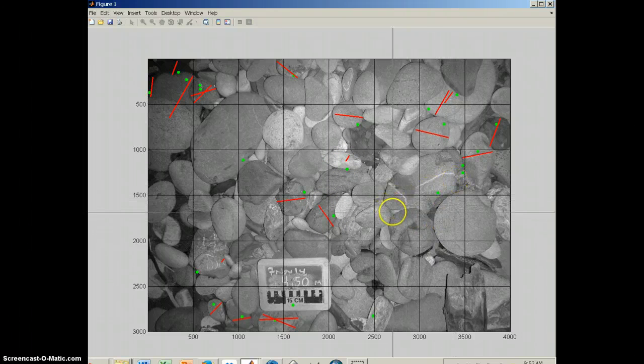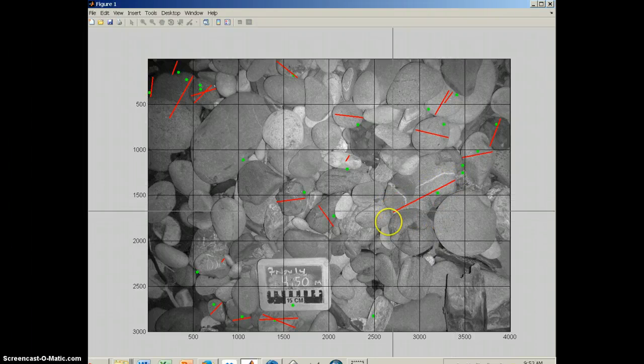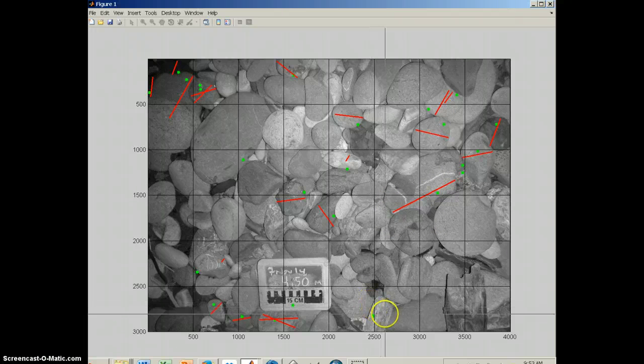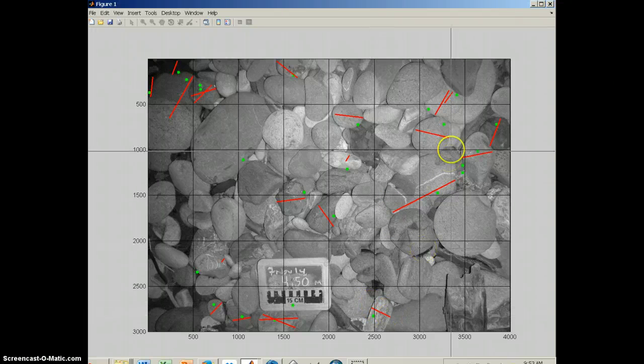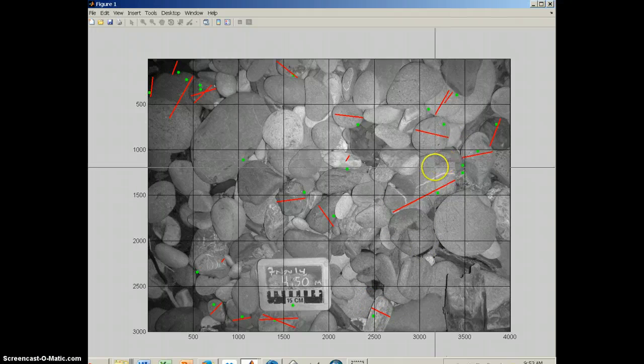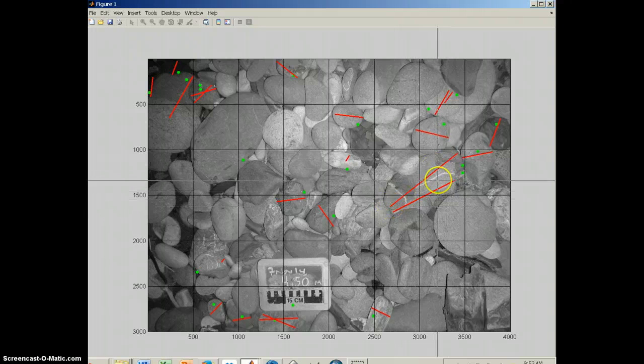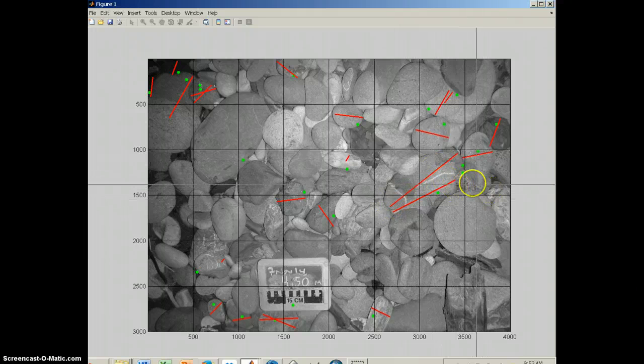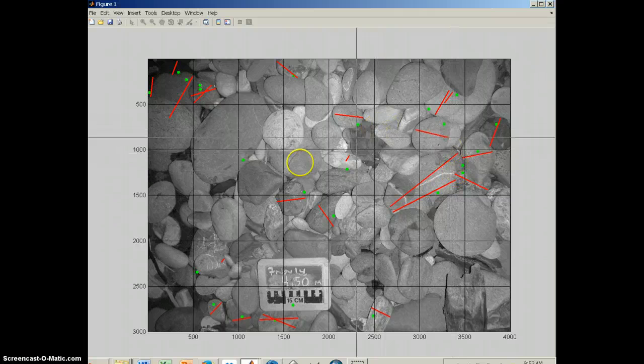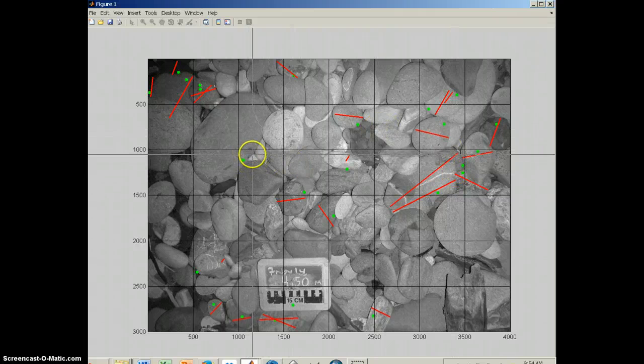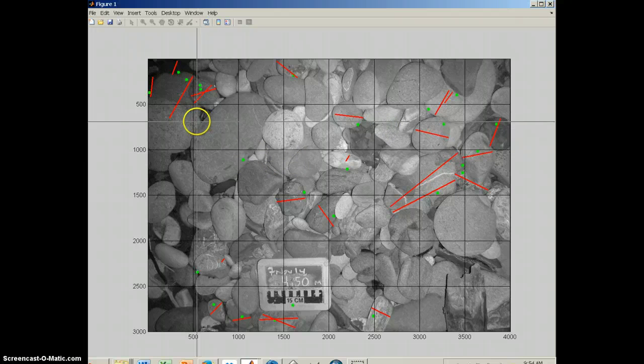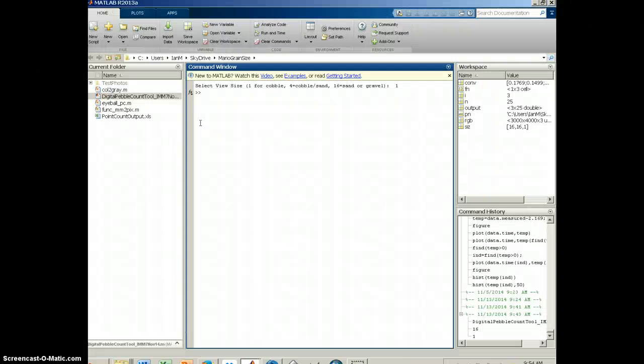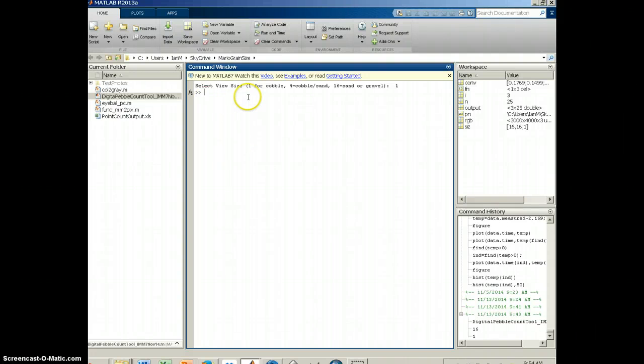And when you are done, there's a pretty big grain. When you're done, it'll automatically move off this screen. Sometimes you miss one and it's kind of hard to see. Then basically once you've run through all your photos, it's done.